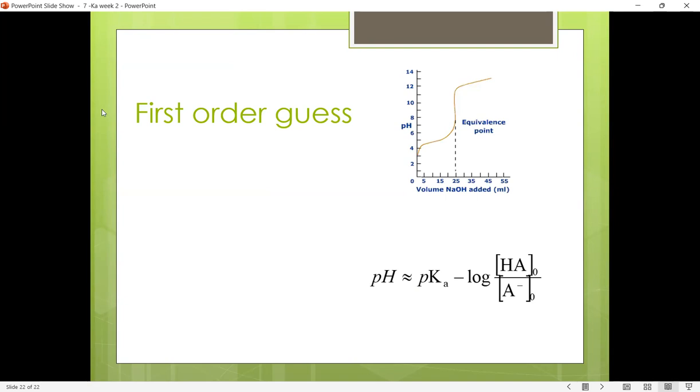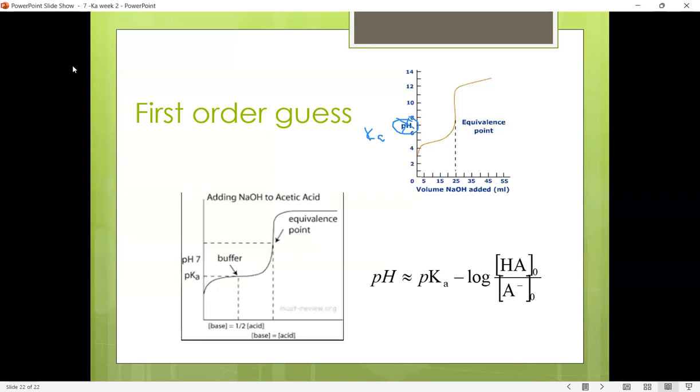Okay, the last thing is that you're going to want to calculate for each point along here. So basically, instead of pH, you're going to be solving for Ka. You're not going to make a graph, although you could, and see a similar type of thing. It will be the same kind of idea here. It'll plateau. So when you get those different Kas, we're going to focus on the Kas around this half equivalence point. And you should get the same kind of number that you approximated before. All right, that's your check for it. All right, that's the lab.